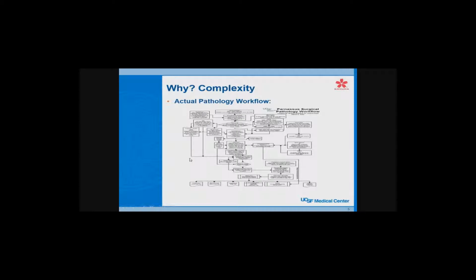The outside impression of histology is that they give us a specimen and we give them a result, and this is pretty much what they think of as this area where it says histology laboratory. To most people, including a lot of pathologists and residents, it is pretty much a black box. They have no idea what goes on in there. All they know is that they get a result out. Our process is actually much more complex.